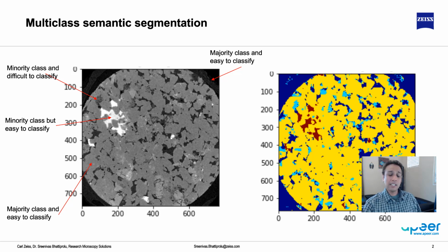We used exactly the same example for our random forest, when we did traditional machine learning. The data set is available. I'll share the link where you can download it so you can practice, but you can practice on any other data set.